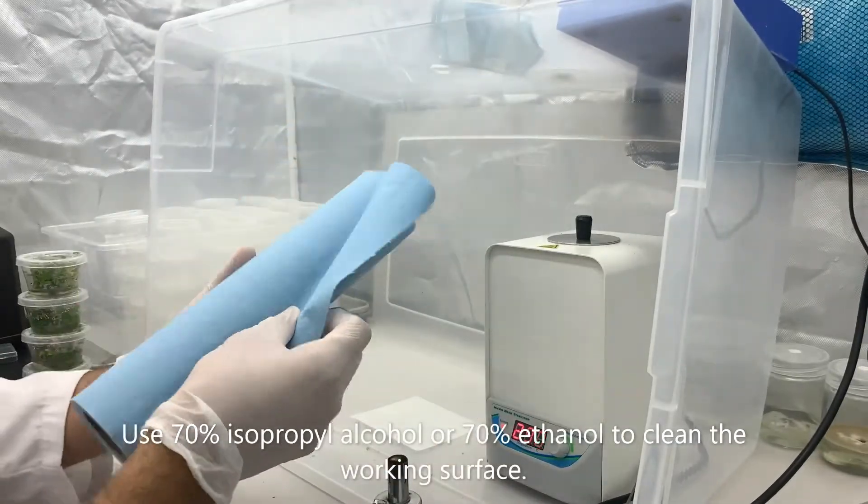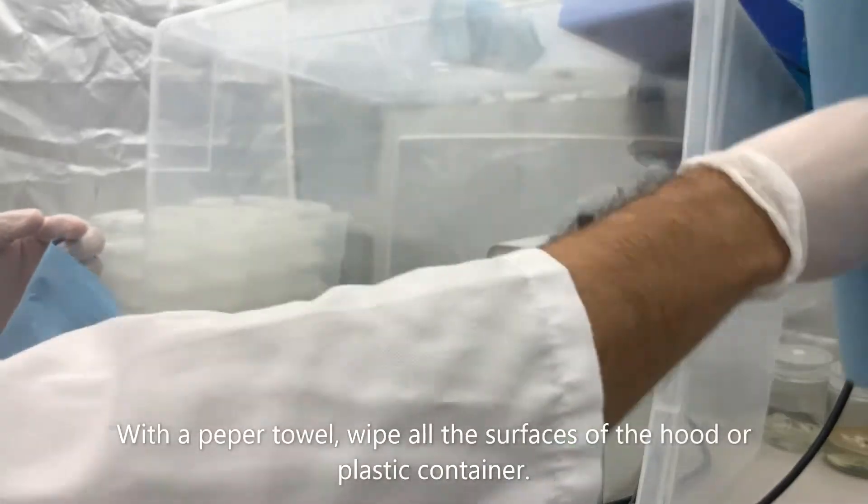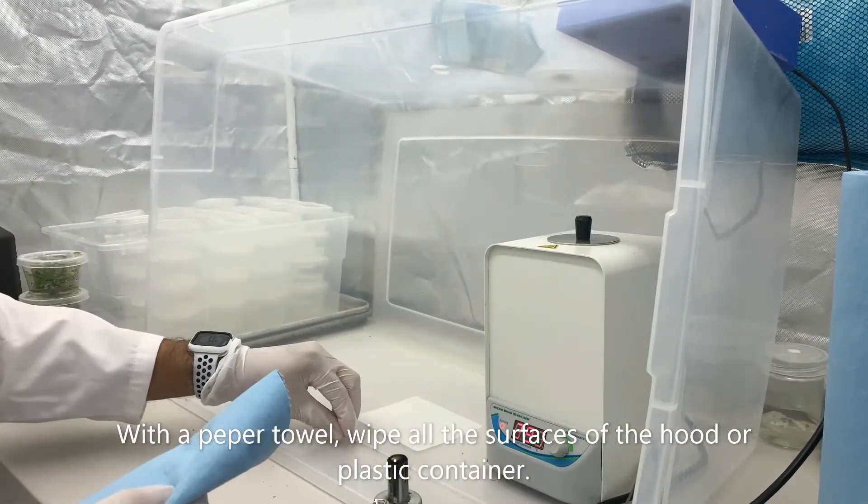First off, we're going to start by cleaning the working area with 70% isopropyl alcohol or 70% ethanol.